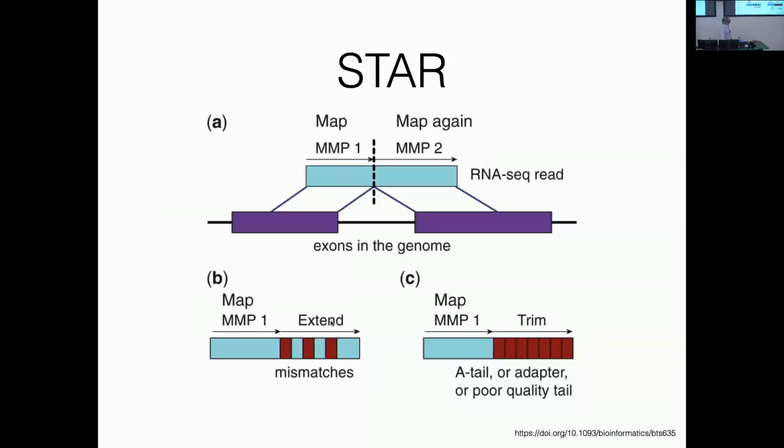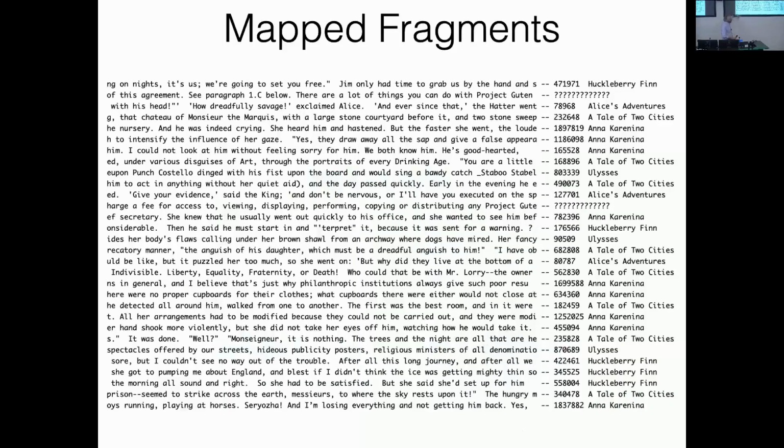And then the third issue, which is not really specific to RNA-seq and is always going to be an issue whether it's DNA or RNA, is that you do have mismatches, right? Before, like I said, our simple algorithm was that if we got to a point where we had a mismatch with our database, we just skip it and keep going.